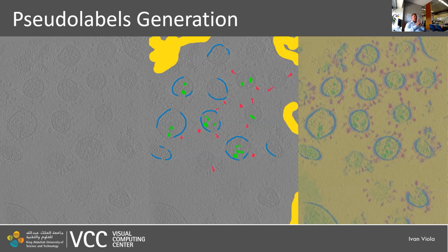So you can see that maybe this differentiable microscopy simulation process can be seen as a neural rendering. And yes, if you are successful in reconstructing your structures, that can be used for pseudo labels, even of the actual labels within your specimen.